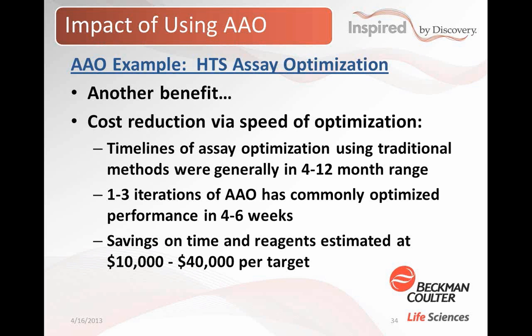And I wanted to note here also that most of the time the iterations were set to 2. Sometimes a single round of optimization was enough, but frequently they would do another round just to get things really tweaked in. And it was very rare that they had to do this 3 times.